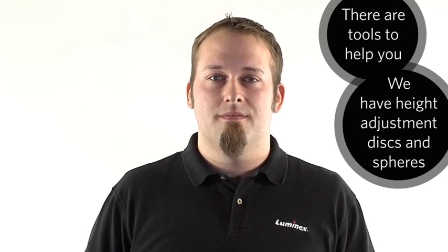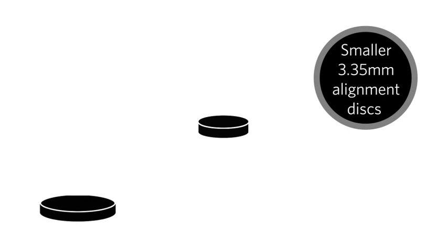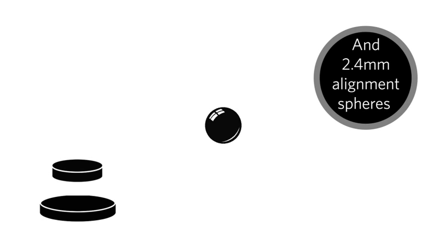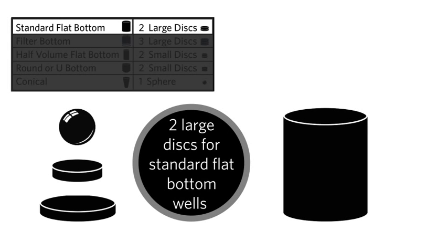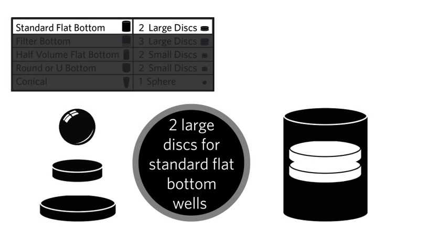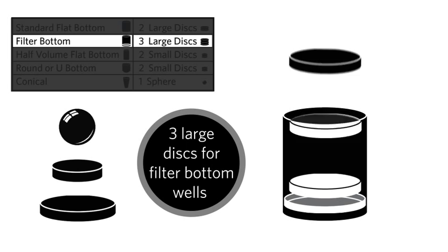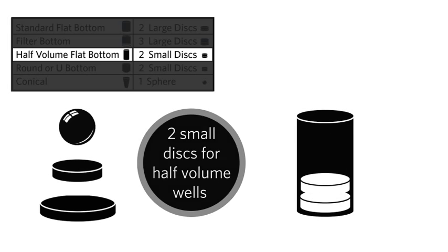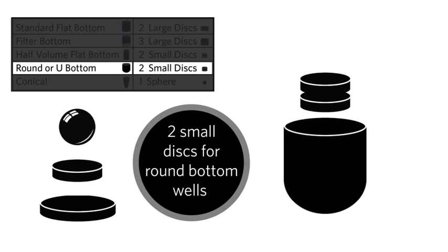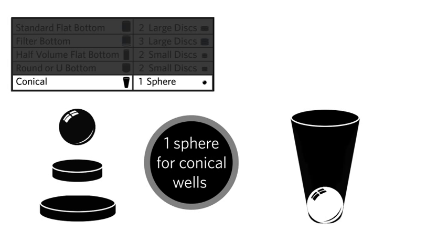We have some tools to help you: height adjustment disks and spheres. There are larger 5.08 mm diameter alignment disks, smaller 3.35 mm alignment disks, and 2.4 mm alignment spheres. For a standard plate with flat bottom wells, stack two of the larger alignment disks together and place them into the selected well. For a filter bottom plate, stack three of the larger alignment disks. For a half volume plate with flat bottom wells, use two of the smaller alignment disks. For a round bottom or U-bottom plate, use two of the smaller alignment disks. For a plate with conical wells, place one alignment sphere into the selected well.